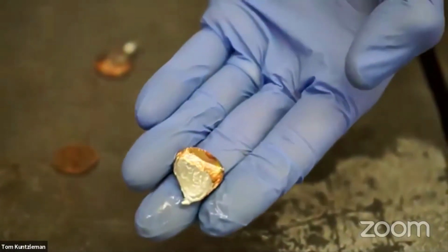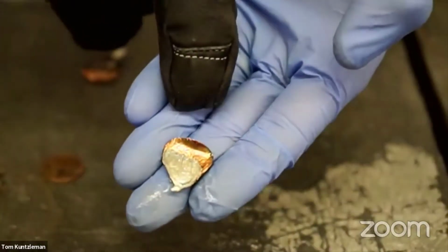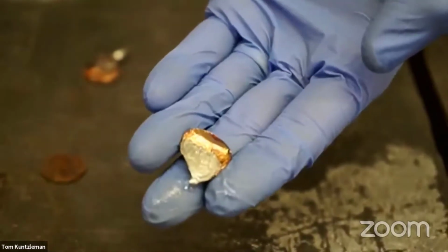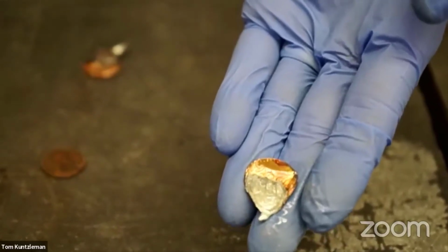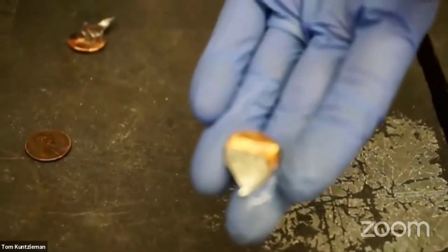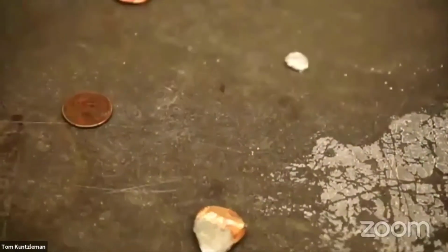Oh, there you can see the golden sheen. Sure, you can see the golden sheen on the penny, and that happened as the zinc melted out of the penny. It mixed with some of the copper plate on the surface, and we sure enough formed some brass, that golden colored alloy of copper and zinc. I'm glad I got to show that for you. Sometimes it doesn't work. I'm glad it worked this afternoon.